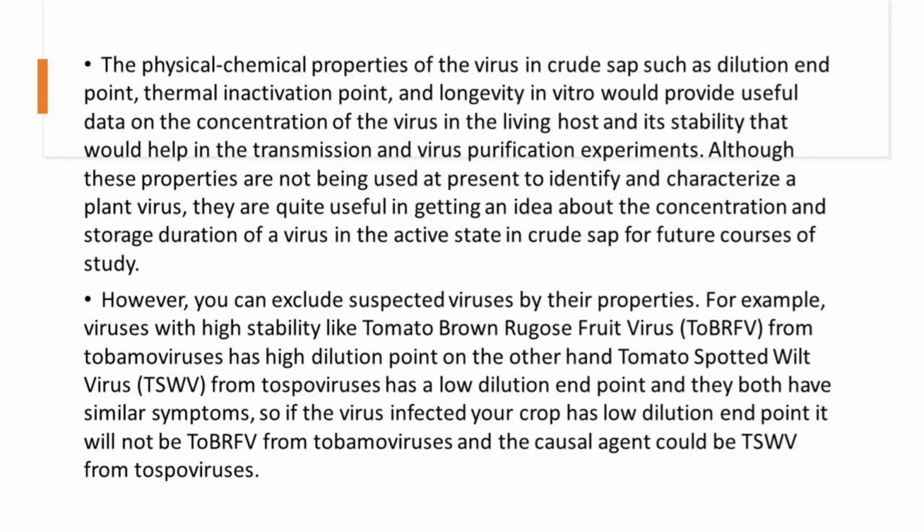The physical-chemical properties of the virus in crude sap, such as dilution endpoint, thermal inactivation point, and longevity in vitro, would provide useful data on the concentration of the virus in the living host and its stability that would help in the transmission and virus purification experiments. Although these properties are not being used at present to identify and characterize a plant virus, they are quite useful in getting an idea about the concentration and storage duration of a virus in the active state in crude sap for future courses of study.